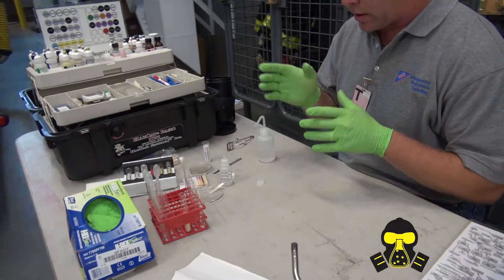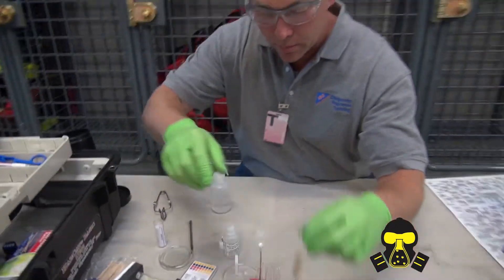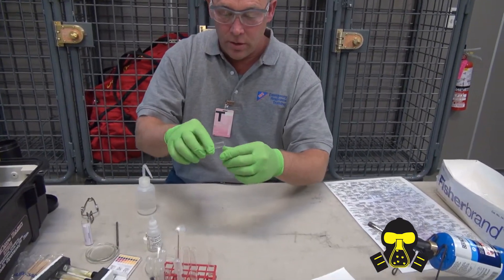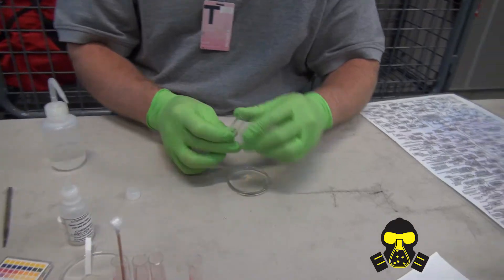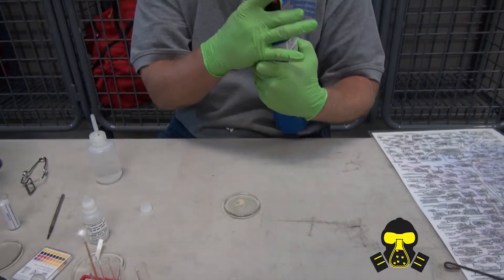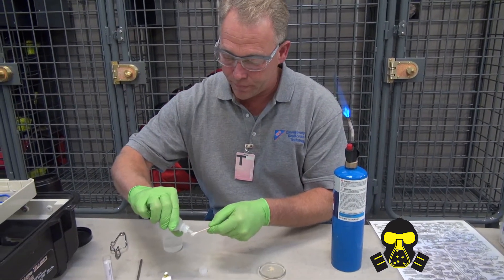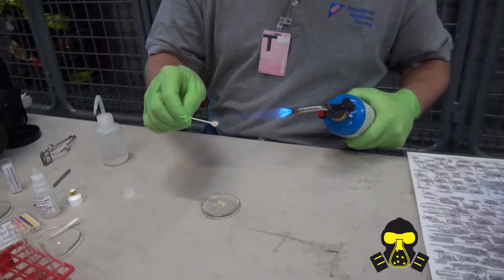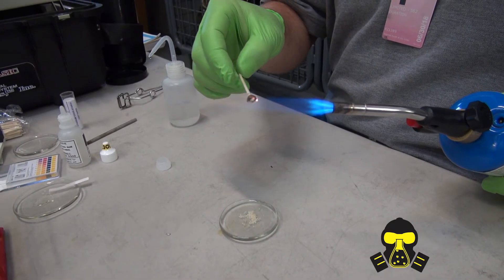Next thing I'm going to do is burn it. I'm going to take a little bit into here. Before you burn something, you want to make sure it's not explosive. There's actually a step for that — put a little bit on here. They want you to do a Q-tip test, but sometimes you don't have time. Drop the acid on here, do a snap, crack, and pop. It's turning black on the Q-tip, so I know this is organic.